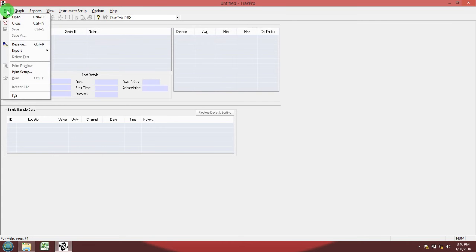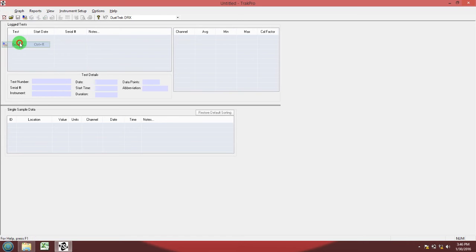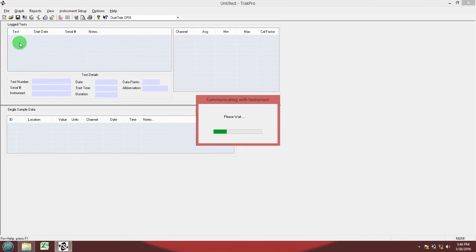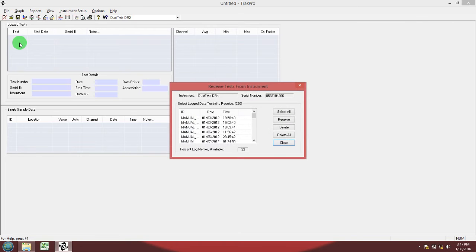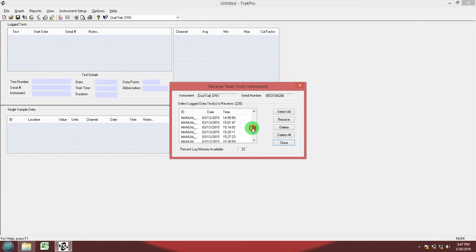Go ahead and go to file receive, and now the DRX is connecting to the computer. Once it is connected with the computer, it will display all the data inside of the DustTrack. Now you should select through the data to find the date and time for which you started your recording session.